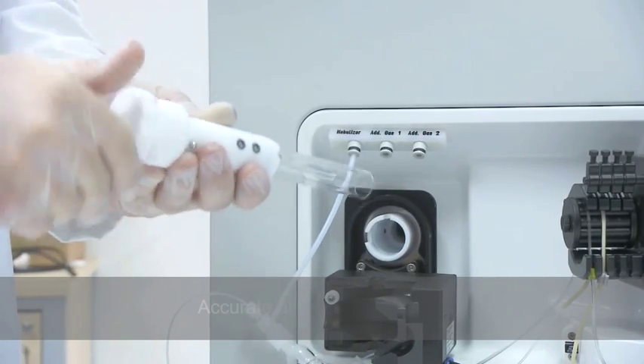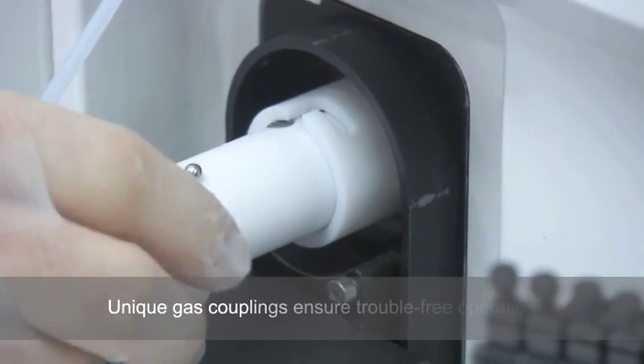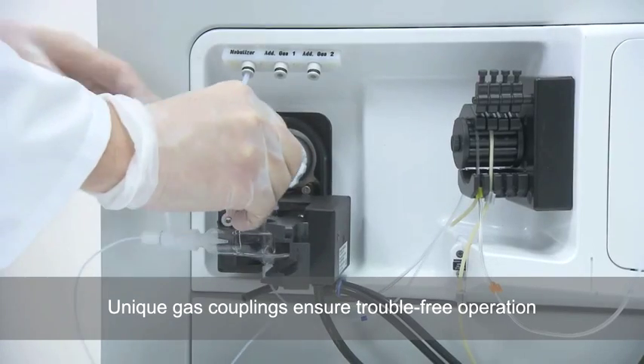Auto-aligning injector guarantees accurate alignment every time. Unique gas couplings integrated within the body of the torch holder ensure trouble-free operation.